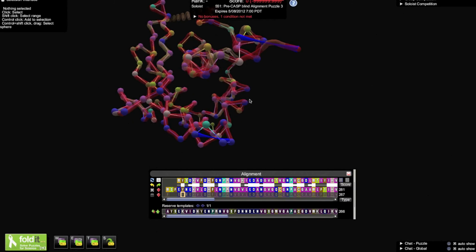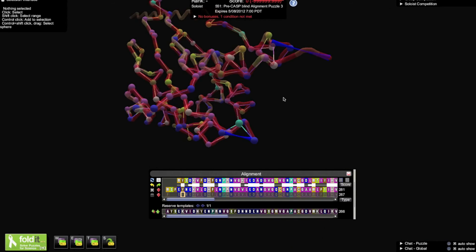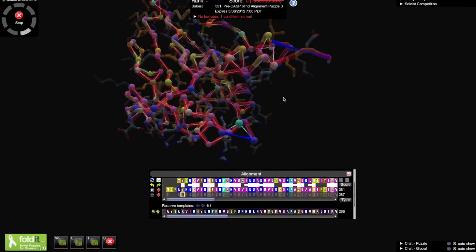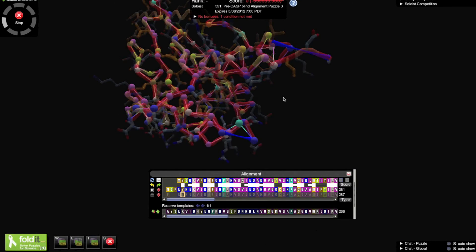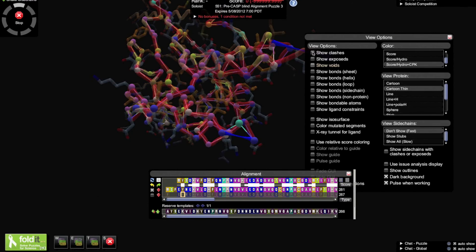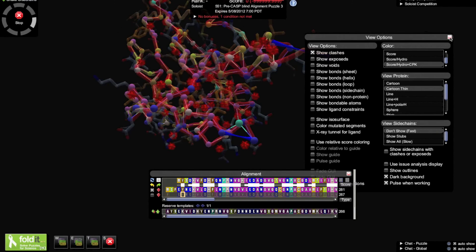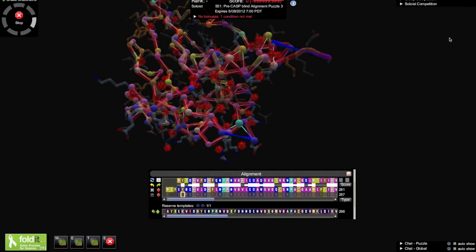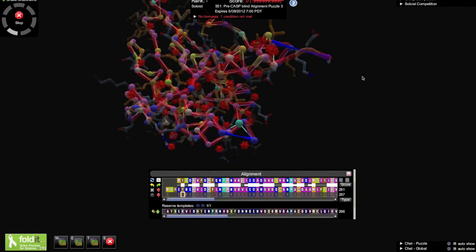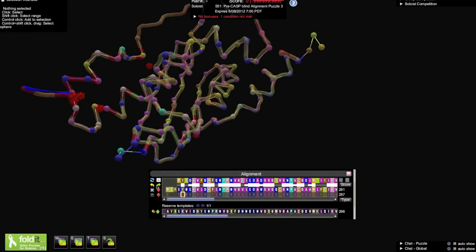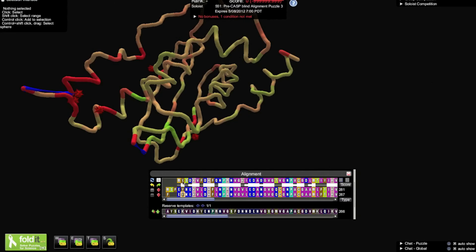The Foldit scores just after threading tend to be bad for two reasons. First is because of the side chain clashing. A quick shake can clean most of these up pretty quickly. The other reason is because gaps, shown in blue, in the protein score very poorly, and need to be fixed before the score counts.